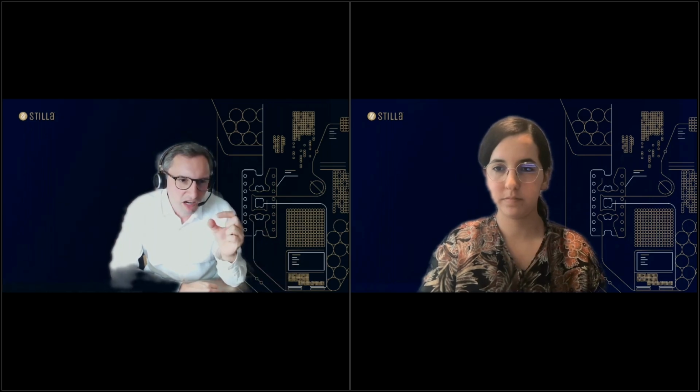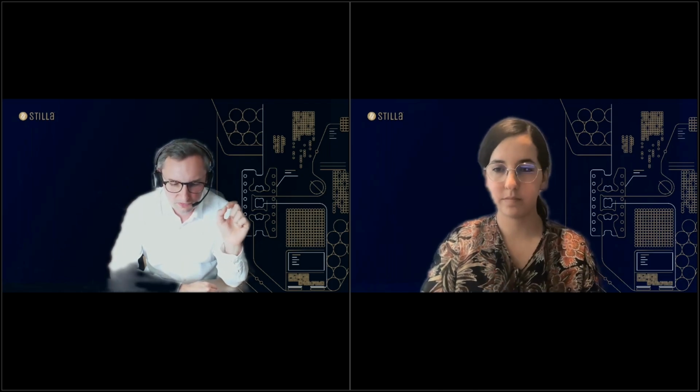And so you will always be able to see a reoccurring one positive droplet for a low abundant target inside of the technical replicates, and you will always be able to distinguish that from the limit of blank or from the NTCs, because you also see the way this droplet appears, as I showed in the presentation. When you have a reliable one positive droplet, it will always reappear. When you have a limit of blank problem, it is very likely that you have one droplet which is somehow low positive, not really positive, and it's not a clear signal. So you will be able to distinguish between that.